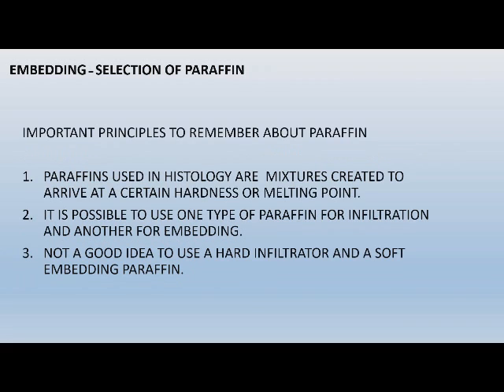Now, when we talk about paraffin, most of the paraffins used in histology are mixtures created to arrive at a certain hardness or melting point.